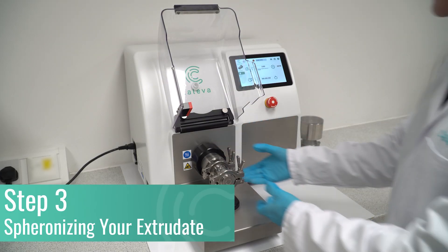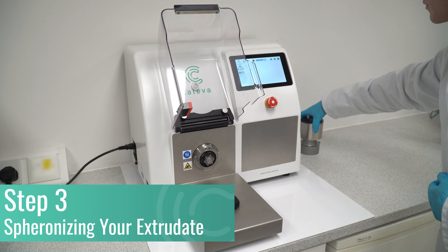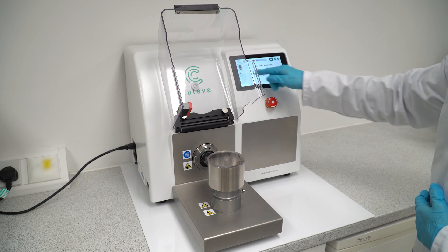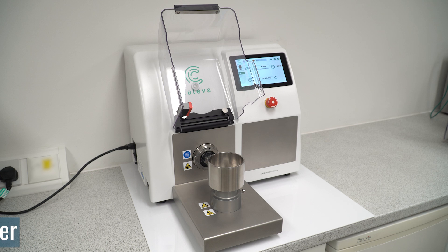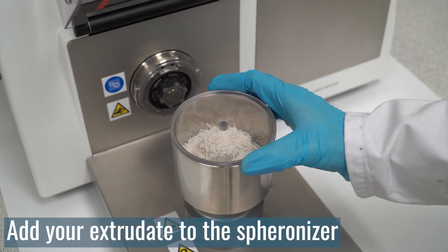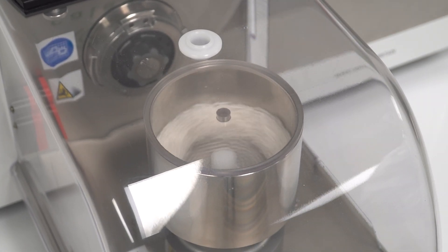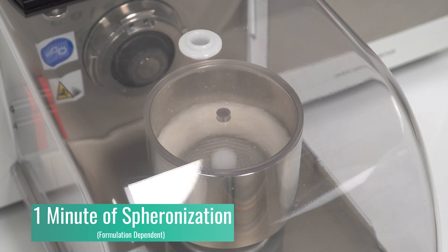Once extrusion is complete, the extruder can be removed and the spheroniser put in its place. Simply pour the extrudate into the spheroniser bowl, close the safety cover and begin. After only one minute of spheronisation, our batch is complete.